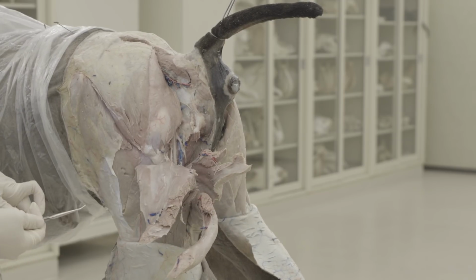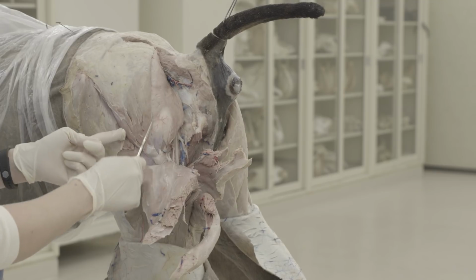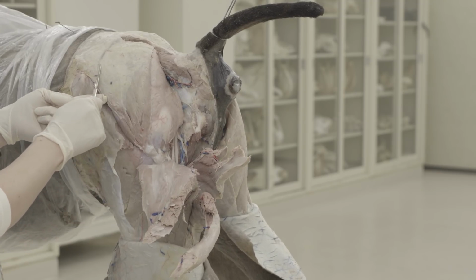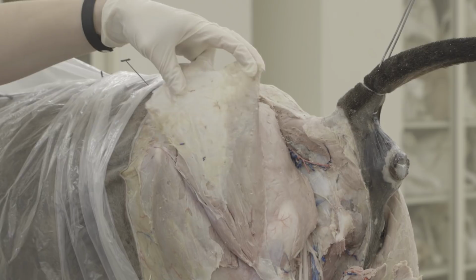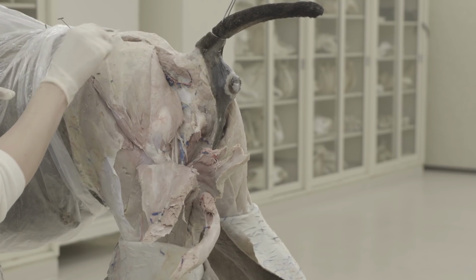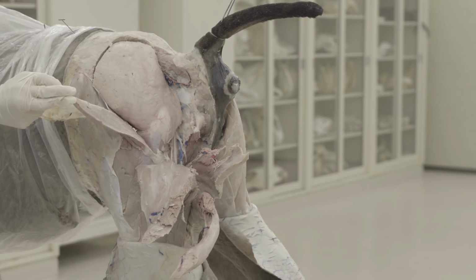Okay, so now we'll work on the gluteals. So you have a superficial gluteal here in the pony, and it's kind of a V-shaped muscle that has two parts to that V, and then in between there's an aponeurosis. So that sheet of fascia is connecting the two parts. So if possible, you want to isolate it and keep part of that aponeurosis with the muscle, but you're going to cut proximally and then reflect distally, just like we've been doing with all the other muscles. So take that, reflect it distally.